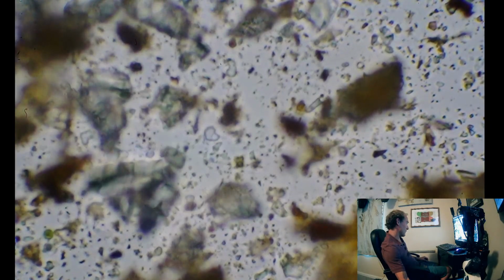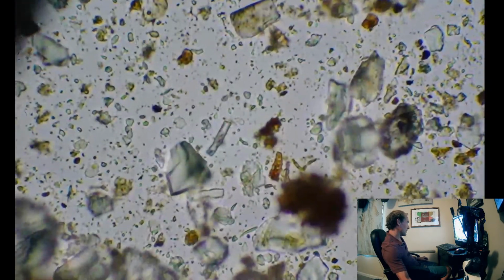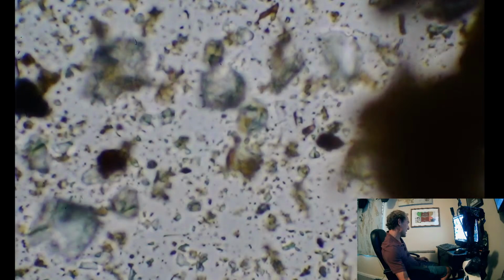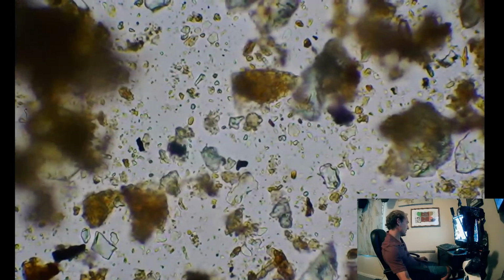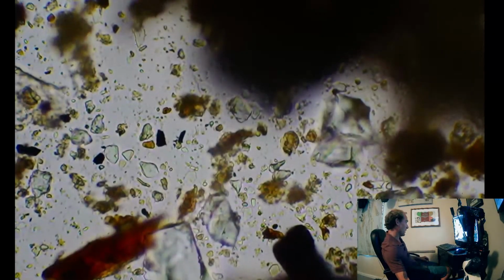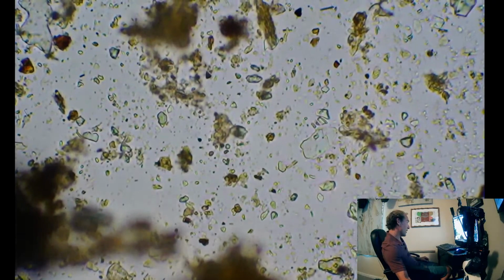Because if I just go out and sample regular clay or topsoil onto the grass, we actually don't see as many fungal hyphae as this. Only if I go into the forest next to my house where there's mushrooms popping up all over the ground and it hasn't been touched in probably about 100 years.